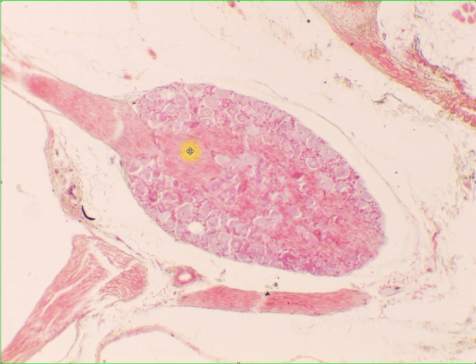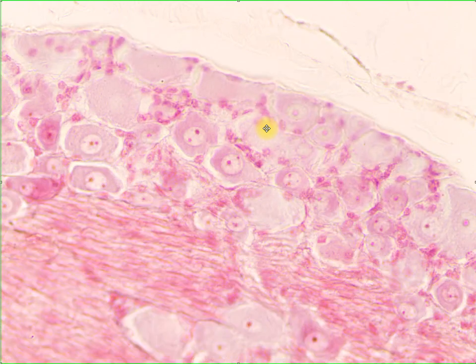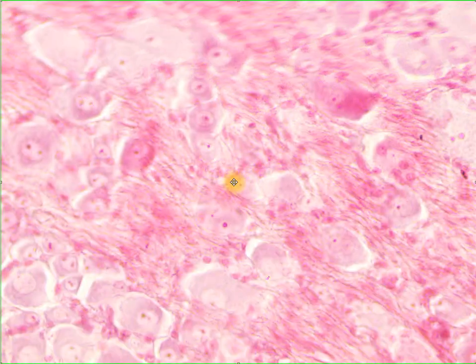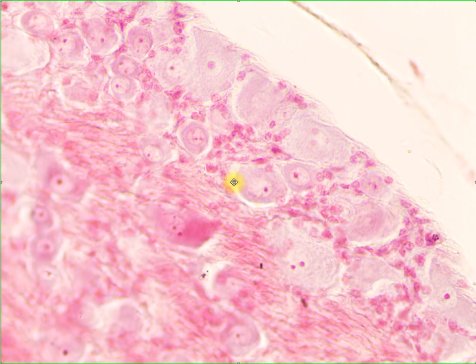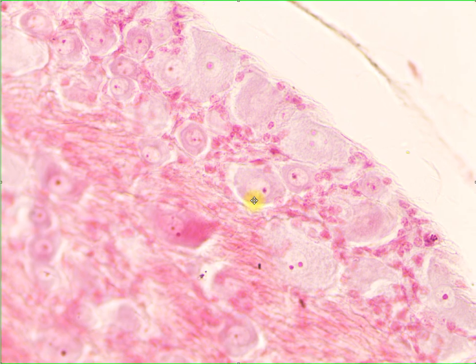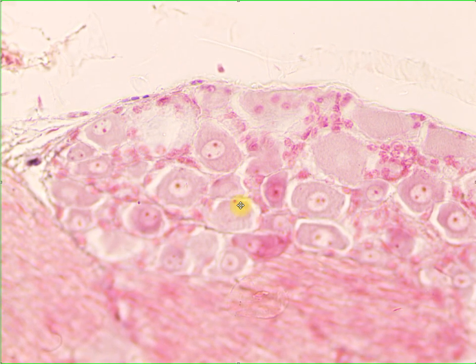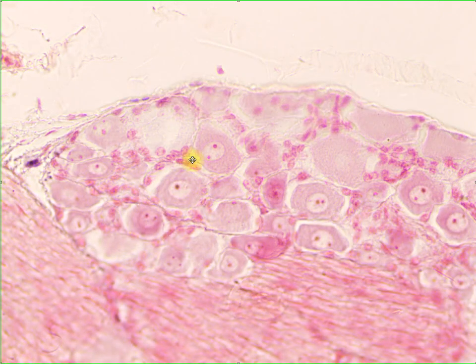And here you can see the axons aside from the cell bodies themselves. Okay? So again, you can see the cell bodies. Aside from the neurons, we can also see a certain type of peripheral nervous system glia in this section, and this would be your amphicytes or satellite cells surrounding the cell body or soma of your neurons in the ganglion. Okay, so this would be your amphicytes.